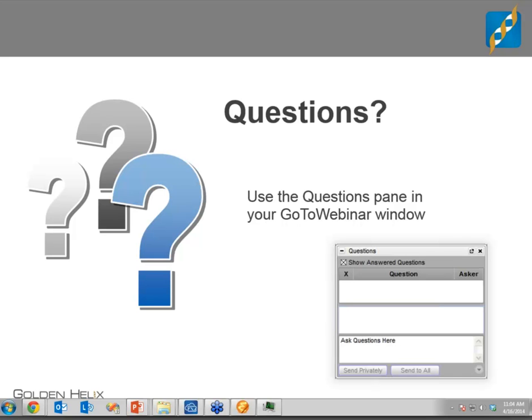You mentioned GMAP. Is that the same as the GSNAP mapper? Yeah, that's what I meant, GSNAP. Okay. Right. Because there was a question, do you have any feedback on it? I haven't had a chance to use it very much. I have had plenty of people talk my ear off about it, so it's obviously got a very passionate user base, and that's the sign of any strong and healthy community and tool. What I have seen though is it's used very heavily on the RNA-seq side, potentially ChIP-seq and stuff as well. Haven't seen it a lot on the DNA variant discovery side.